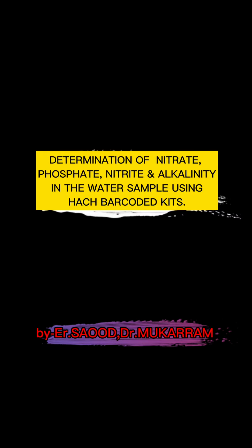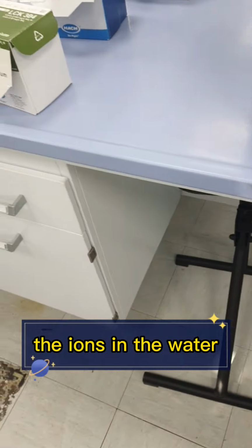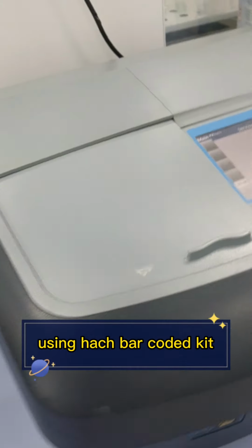Determination of nitrate, phosphate, nitrite, and alkalinity in the water sample using Hach barcoded kits. Guys, today we are going to find out ions in the water using Hach barcoded kits.